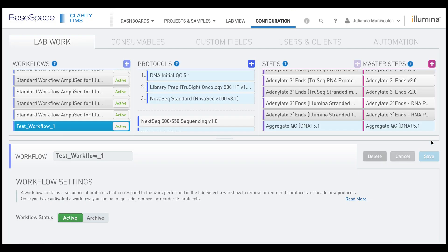After clicking Save, the workflow no longer has a pending tag next to it. It is now active and you can assign your samples here.